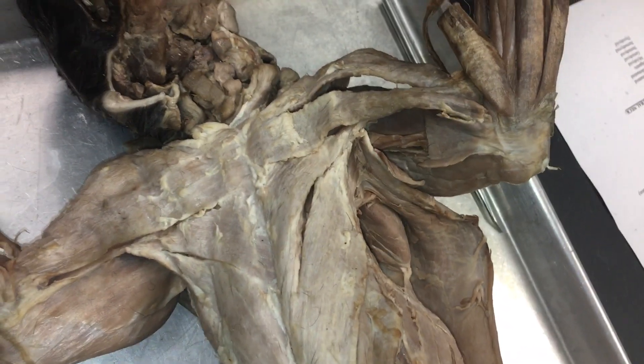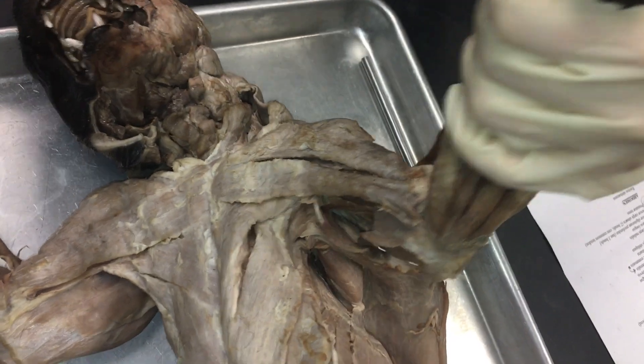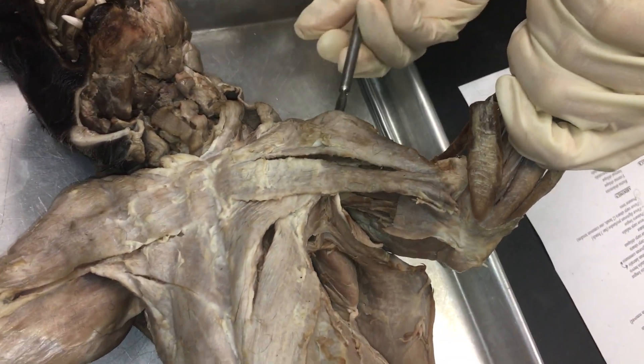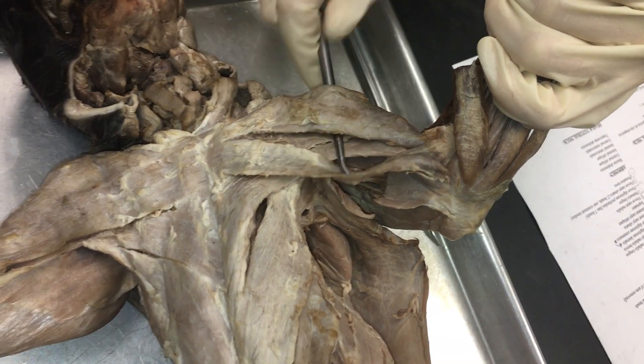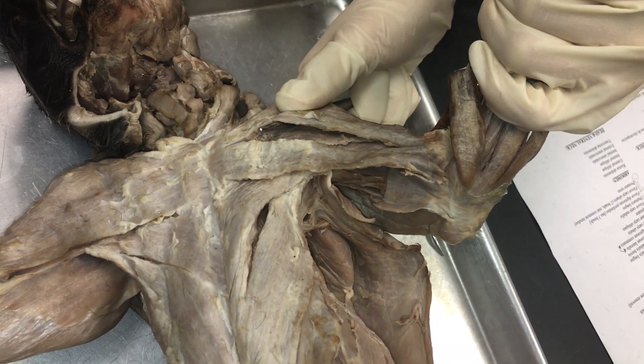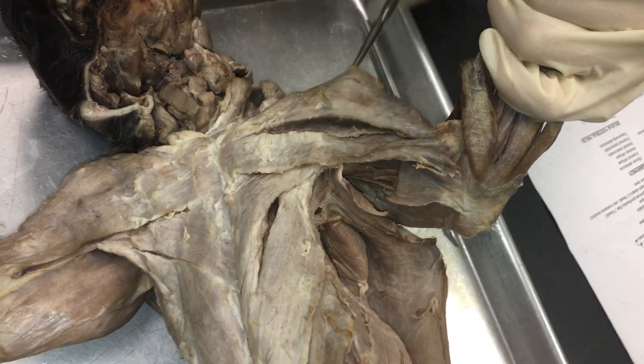We're going to go over the muscles of the arm and chest. Starting from this muscle here, this is the clavodeltoid, which is also known as the clavobrachialis.